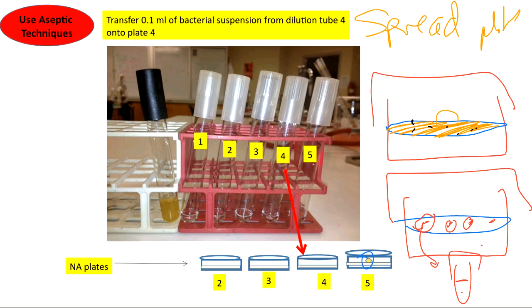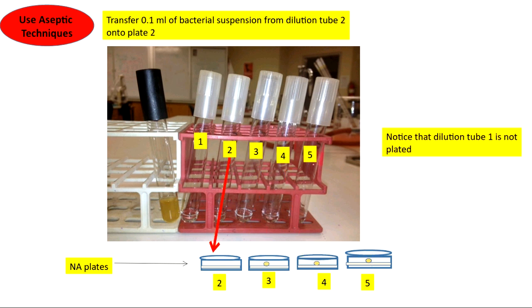The function of both plates is very similar. It is counting cells per mil, with the caveat that the spread plate allows you to also separate and pick up colonies.